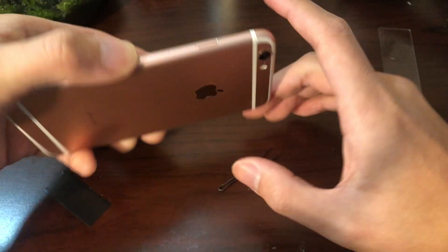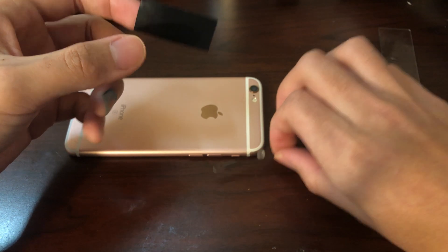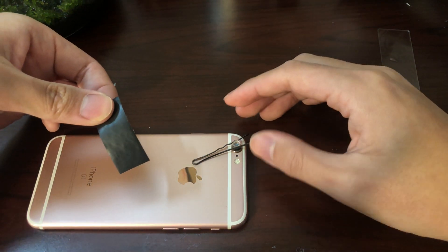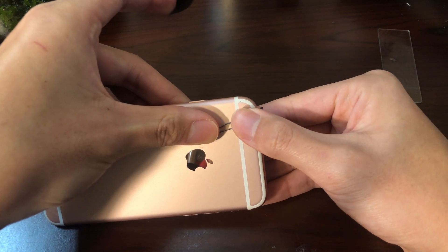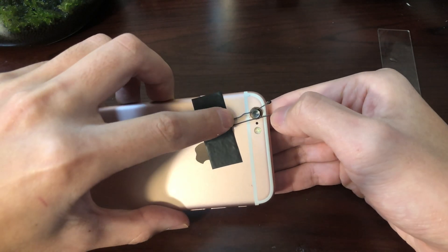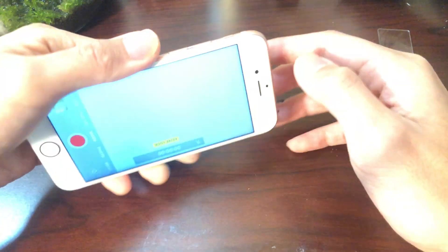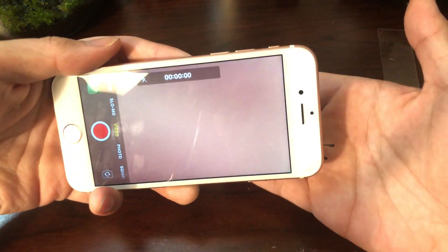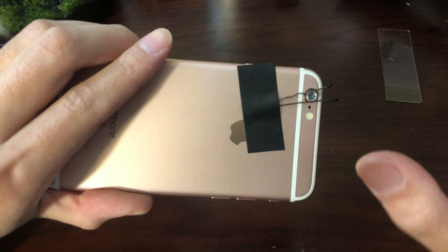Next we're going to take our phone, lay it upside down, and take the piece of tape with the bobby pin and just put it over the camera like that. Make sure that it matches the camera perfectly, then tape it over like so. On more recent models you might have more than one camera — that's not a problem. Just cover up one camera at a time and see if it's working. If it's doing the right thing you're going to see a very hazy-looking image. Switch around the cameras until you figure out which one is right.